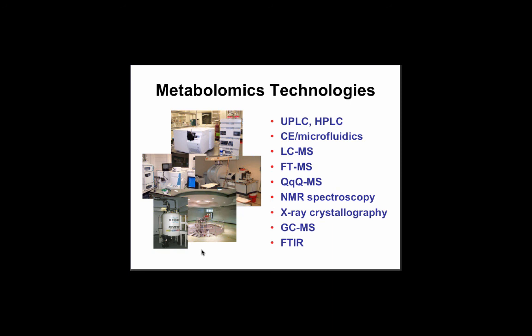So metabolomics labs are usually pretty complicated analytical chemistry labs. And yes, many people doing metabolomics were formerly in proteomics or still actively doing proteomics, but you'll also find people who were formerly in structural biology or people who were traditionally analytical chemists. So the diversity of equipment is one reason why I'm going to spend the next 30-40 minutes on the techniques used in metabolomics.